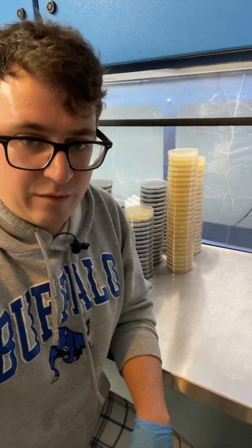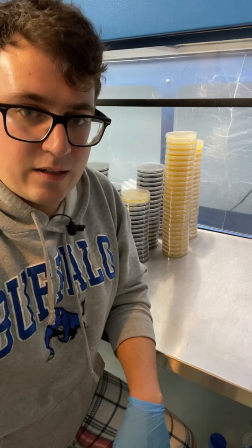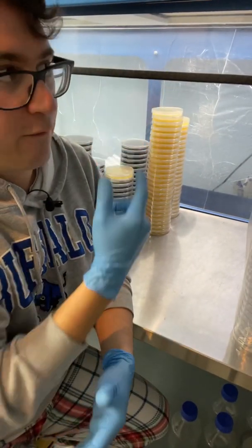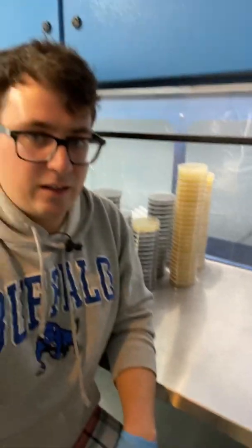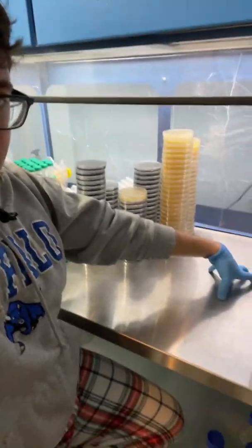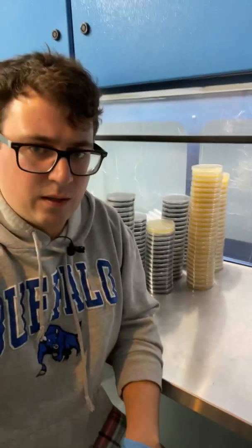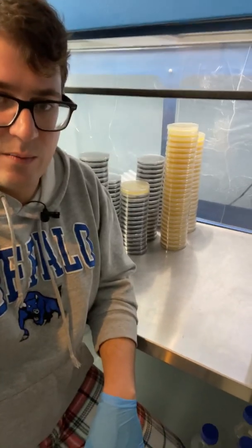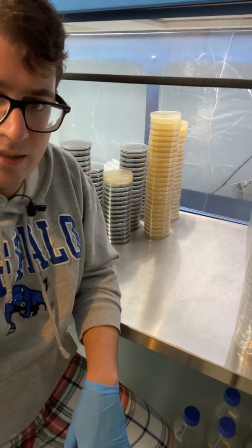What size flow hood would I start with? I would definitely get a two foot by four foot at least. This one is four foot by four foot or four foot by three foot vertical. I'd recommend at least getting a place where you can have something cooling and still have space to work with — so probably four feet minimum. They do sell two foot ones, but it's almost too small unless you're just doing hobby stuff.